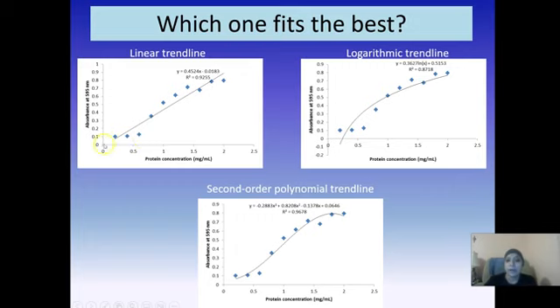If you have a very, very low concentration of protein or the substance you're examining, it may not be able to give you that relationship accurately. Similarly, in every case, there's going to come a concentration where no matter how much more you add, it's already super saturated and it's going to plateau out. So the sweet spot is obviously this linear range, but some of your samples may not be in that linear range, which will force you to use one of your other trend functions.